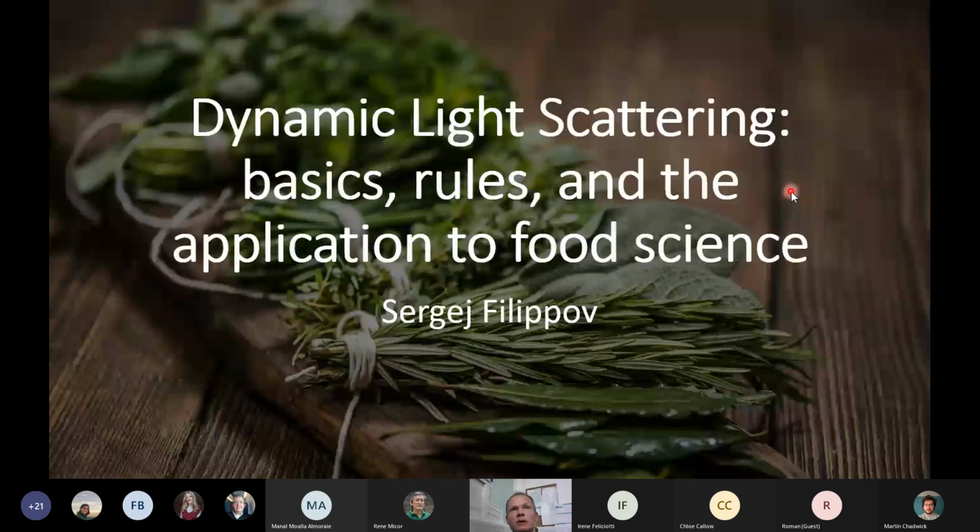In my work, I'm using a lot of physical instruments like dynamic light scattering, small angle X-ray and neutron scattering, zeta potential, and electrophoretic mobility experiments just to study polymers, any type of polymers, polymers for drug delivery, polymers in food science. Today I will be talking about one of such techniques.